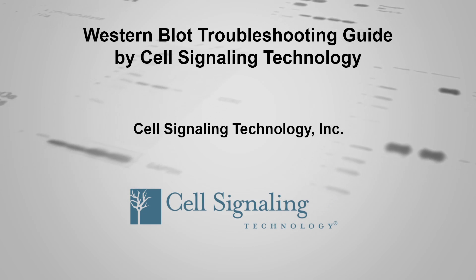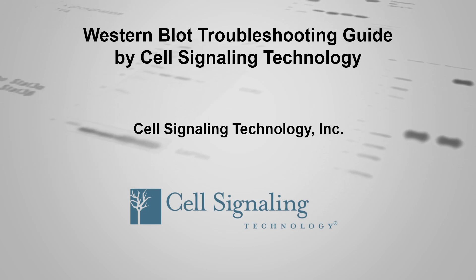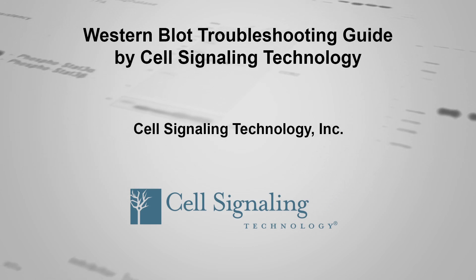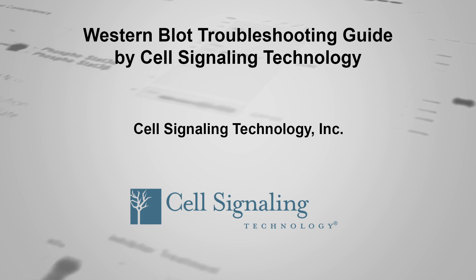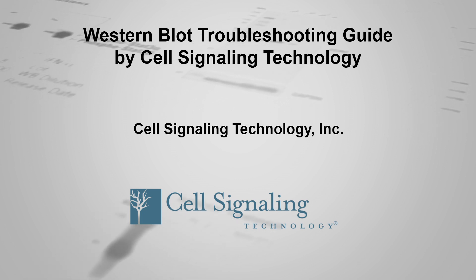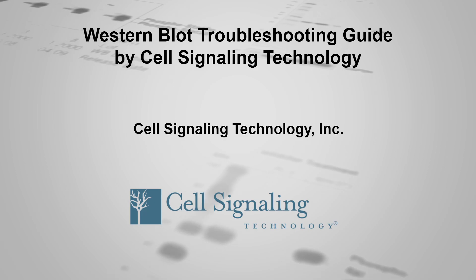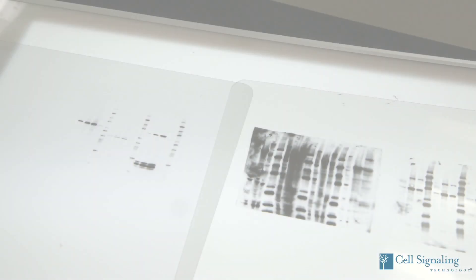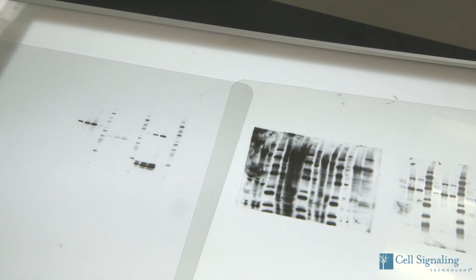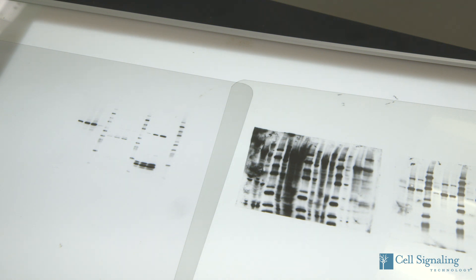Western blotting, also called immunoblotting, allows researchers to determine levels of protein expression in a cell or tissue extract through antibody binding to a specific protein of interest. Although this technique is widely used and accepted, problems can occur that lead to suboptimal results, such as low signal or high background, resulting in blots that are difficult to interpret or quantitate.